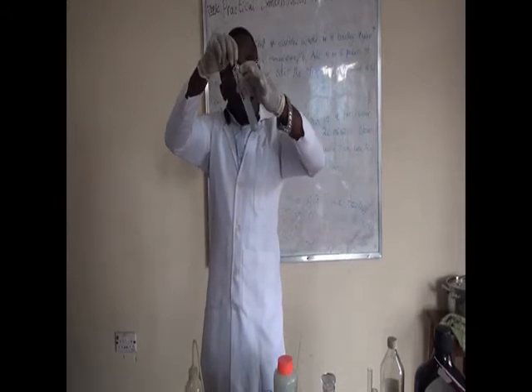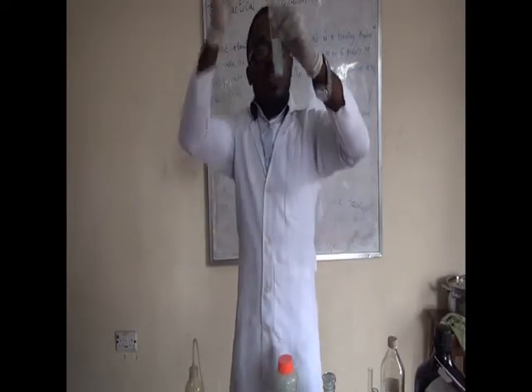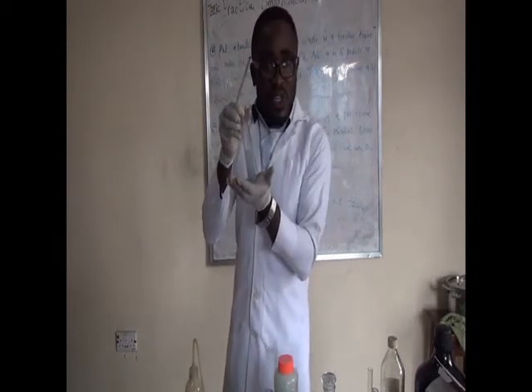Of course, sodium hydroxide would dissolve in water. Based on the solubility of substances, sodium, potassium, ammonium compounds will dissolve in water, according to the rules of solubility. Now, with the sodium hydroxide, from here I can feel heat. When you're doing yours, you touch the test tube, that's your observation.